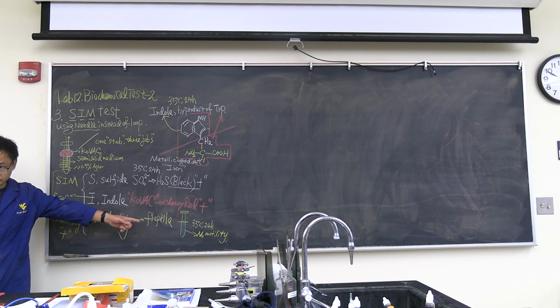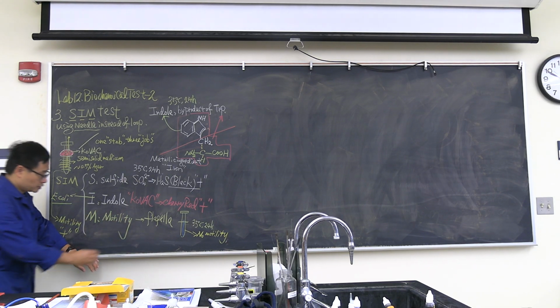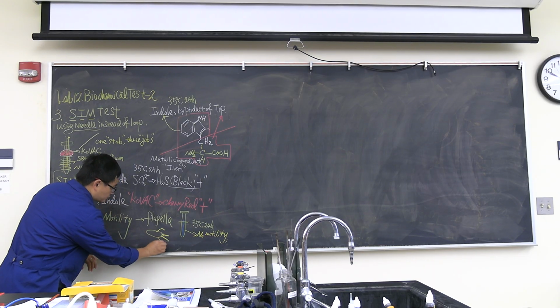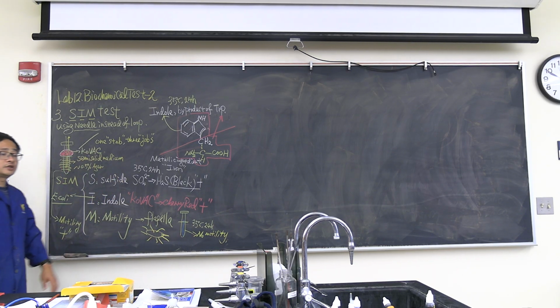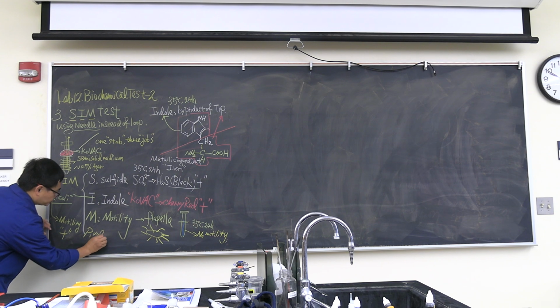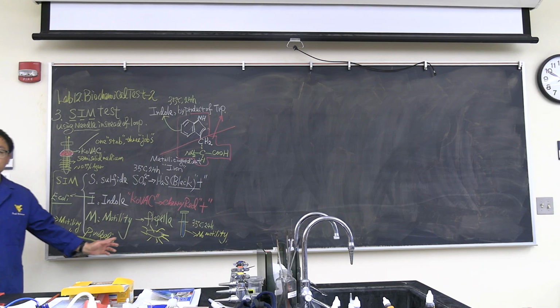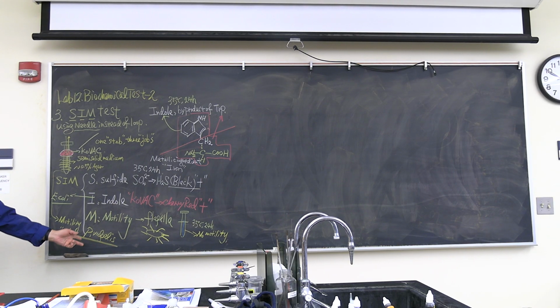Remember flagella we talked about: monotrichous, amphitrichous, lophotrichous, and peritrichous, which means flagella go everywhere on the surface. A pathogen that is very typical for motility positive is Proteus vulgaris. We used to do this in the lab. We are not allowed to do it because it's a soil pathogen. And today we'll use citric acid bacteria, Citrobacter, as a replacement, as a surrogate.